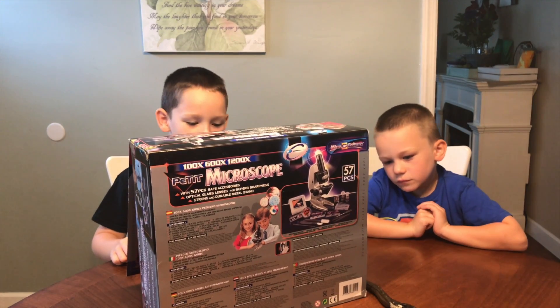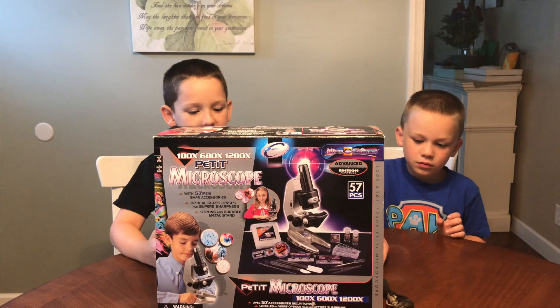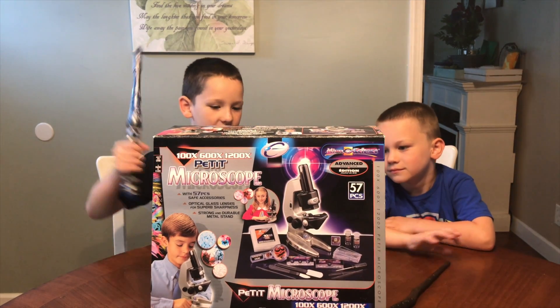I can't wait to open it. Thank you so much for sending this to us for free. But you should know that this is for ages 8 and up. Now let's get this open.